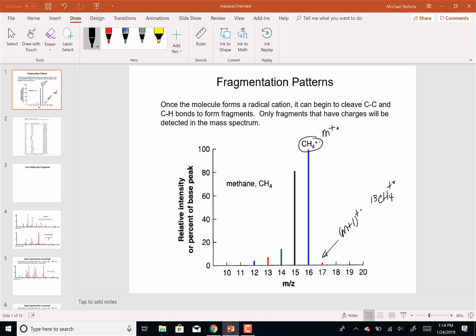My primary goal as we go through these different fragmentation patterns is to focus on carbocation and radical stability. It's going to help reinforce what we learned in lecture, even from last semester, even from resonance structures in the first couple of weeks of classes last semester. So we'll actually go way back, or try.